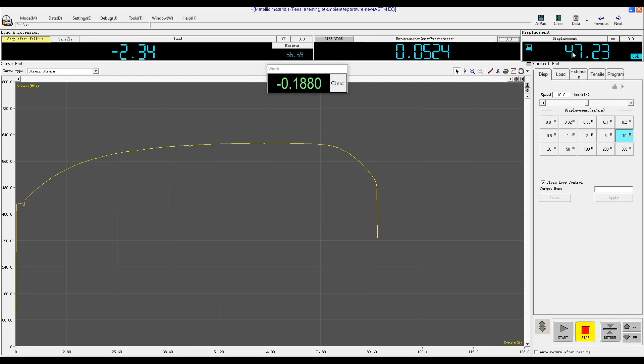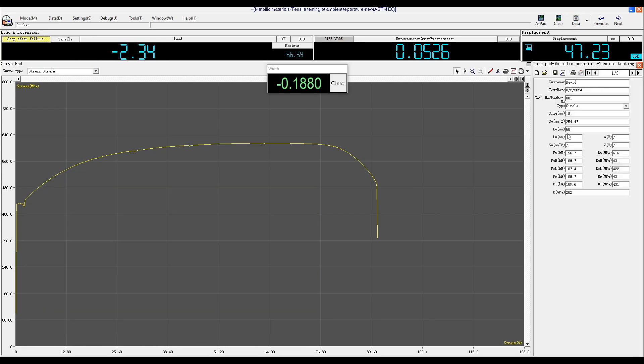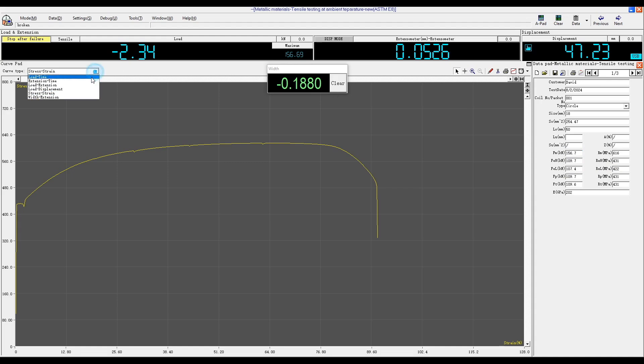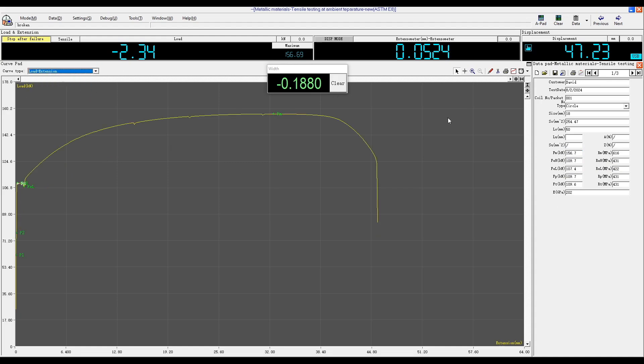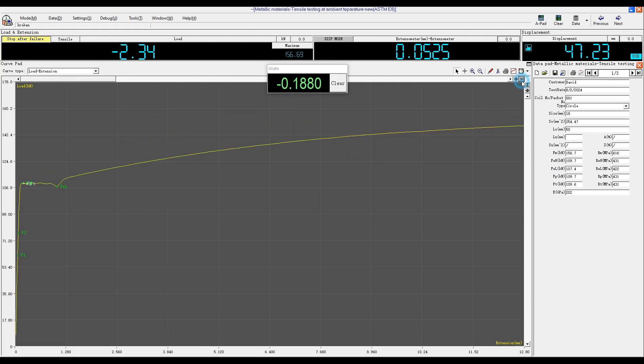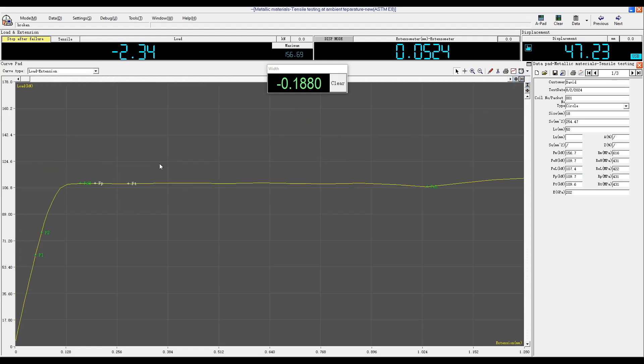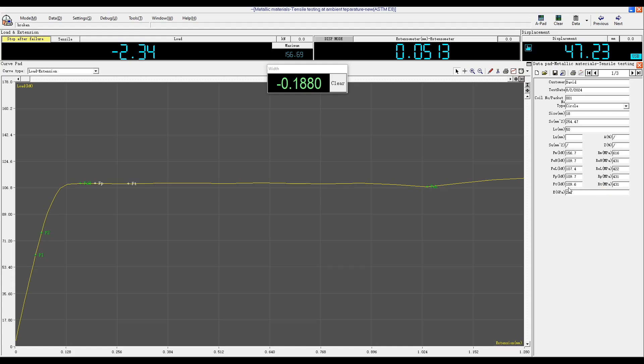You can click on the data tab to check the test results. The maximum force is 156 kilonewtons. RM refers to tensile strength, while FEH refers to the upper yield load force. We can also check the load extension curve. REH refers to the upper yield load strength, while REL refers to the lower yield strength.